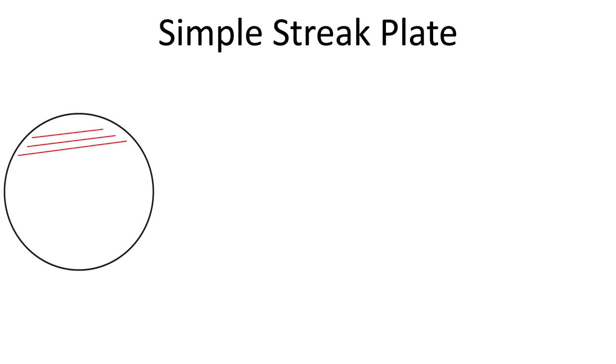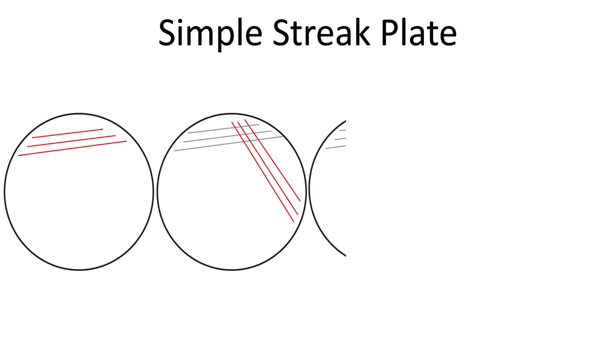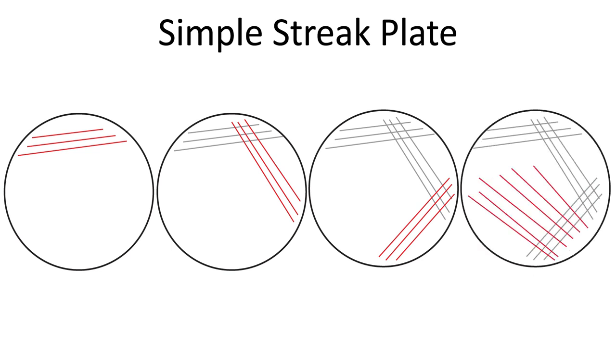Flame your loop cool it off and now you want to do three more streaks again across the plate and each streak should be crossing over the streaks you made before. Flame your loop do this a third time so you're going to cross the second set of streaks three times each time streaking out each time crossing those of the previous streaks and then the last time you do this you just want to streak multiple streaks into the center as many times as you can.